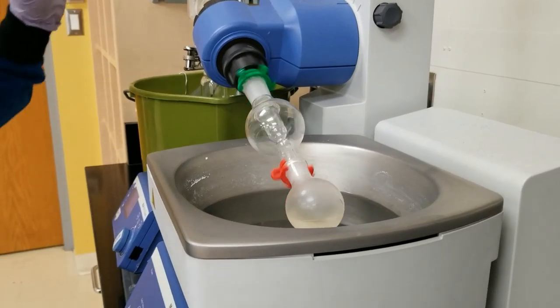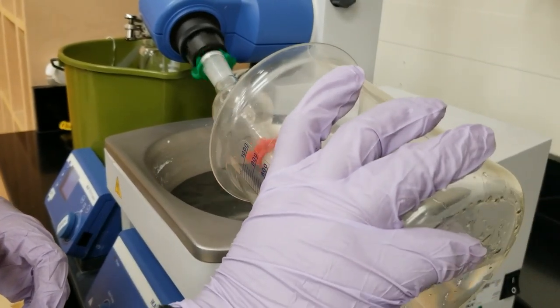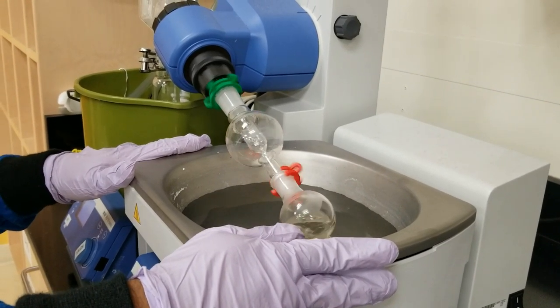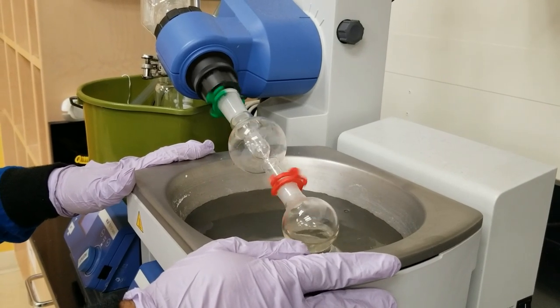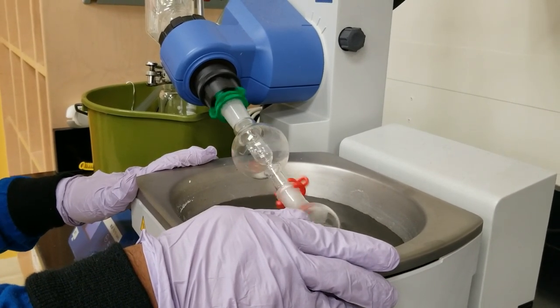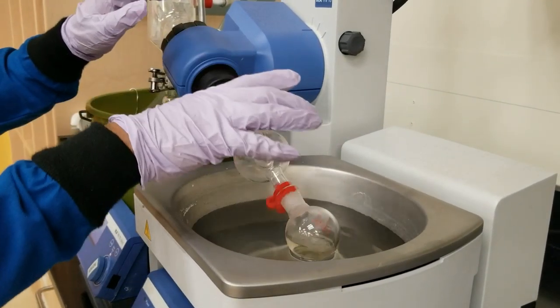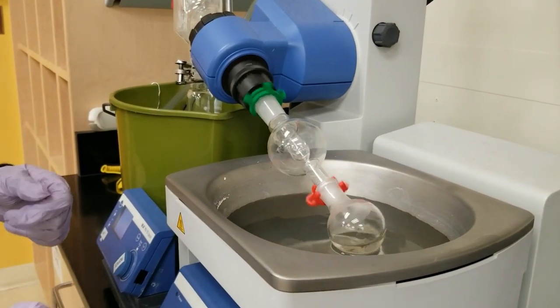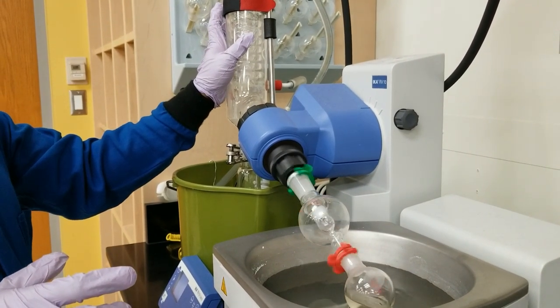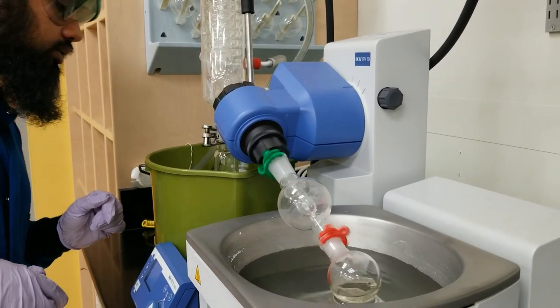I'm pretty sure that you have used this apparatus before. It has three parts in it. This part is the water bath or the heat bath. We are not using any heat for this experiment because we are removing ether, which is pretty volatile. This part is the trap where the solvent comes off, and this part is the condenser, which is recondensing the vapor of the ether back to liquid ether in this big trap.